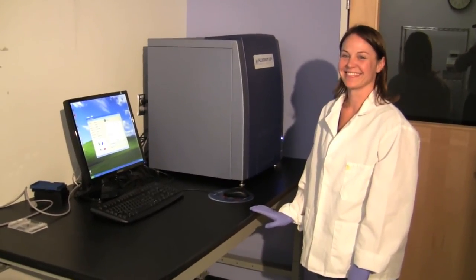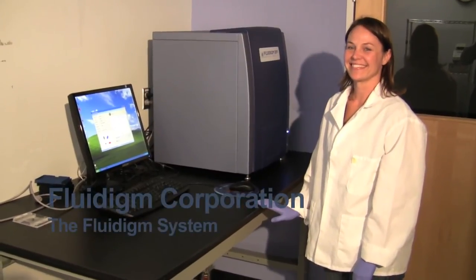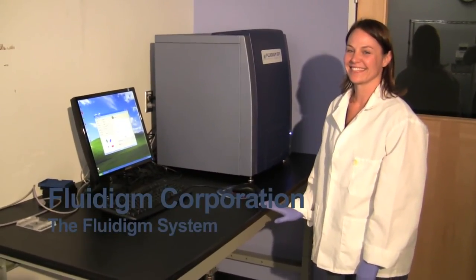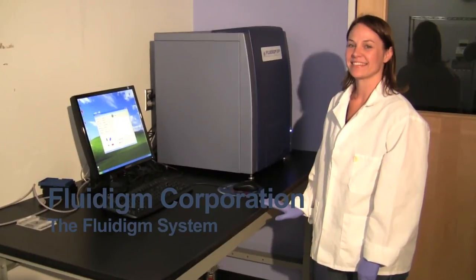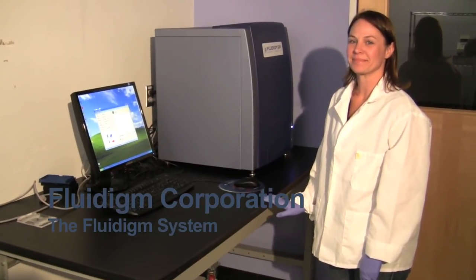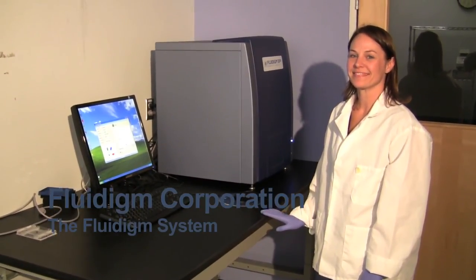Thank you very much. That's Amy Hamilton with Fluidigm, giving us a demonstration of the workflow using the Fluidigm system here at Fluidigm Headquarters. I'm Chuck Zimmerman, recording. Thank you.